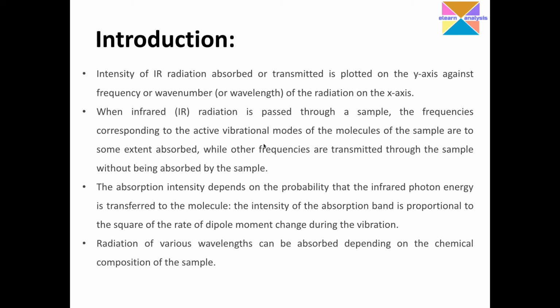Not all the functional groups in a molecule will show absorption at once, but rather they show absorbance of the incoming frequencies at certain wave numbers or wavelengths. Not all the functionalities will vibrate at once, but rather they vibrate at their corresponding frequencies, and once they match the incoming frequencies, they tend to vibrate. And whenever they vibrate, we say the sample has absorbed the infrared radiation.